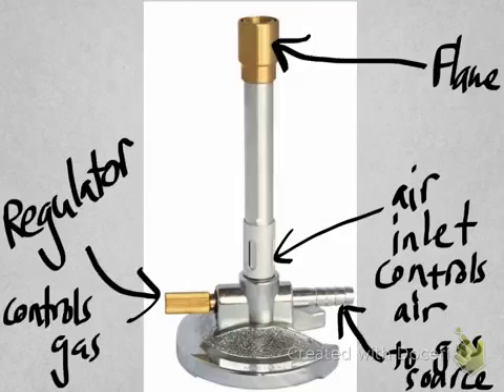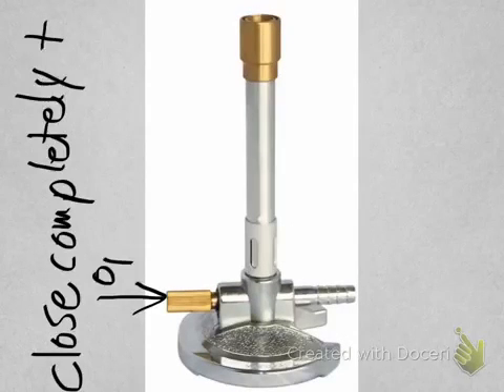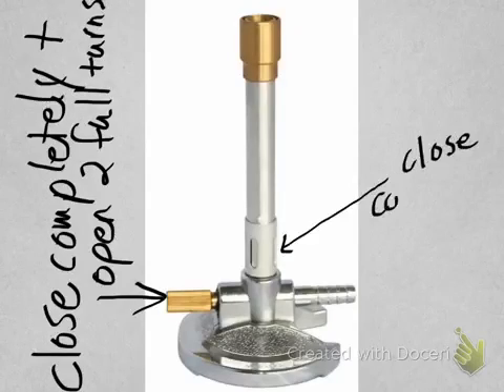The flame comes out of the top of the Bunsen burner. When you're ready — you've secured your area, secured yourself, checked your equipment and checked your hose to make sure there's no cracks or holes where gas can leak into the room — you are ready to set your Bunsen burner up. To set it up, close the regulator completely and open it two full turns so you know how much gas is coming out.